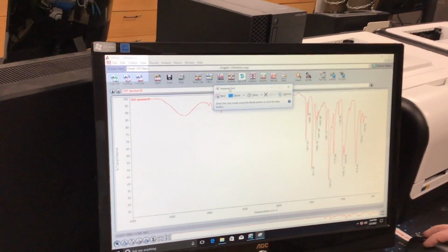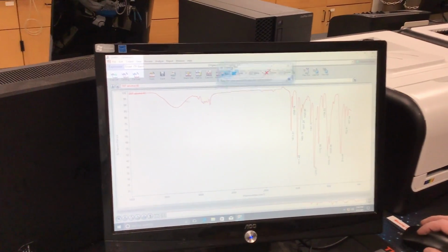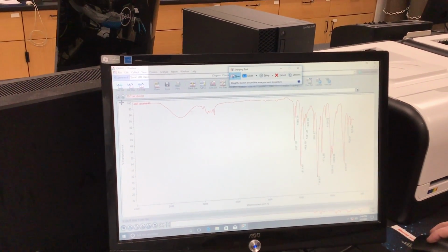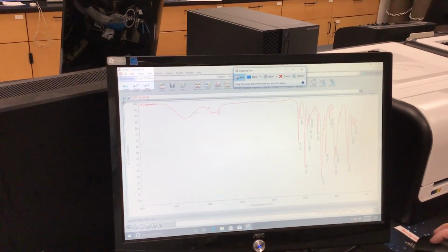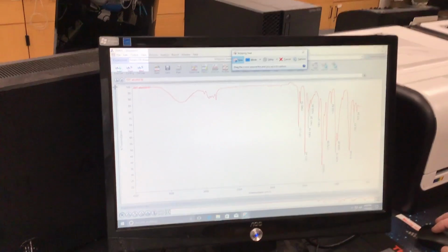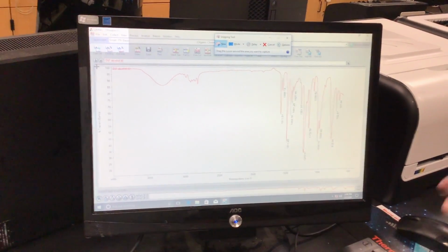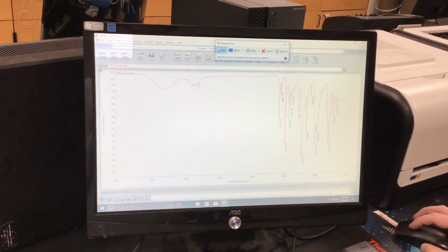When this window pops up, you click New, and then you see that there's like a frosted overlay. This means that you're ready to take the snip. And they've given you a cursor so you can more easily identify where you start taking the image on the screen. When you do this, it will freeze whatever's going on. It'll take the last image whenever you run it, and then this is your cursor that you will use to pull the image from the screen.